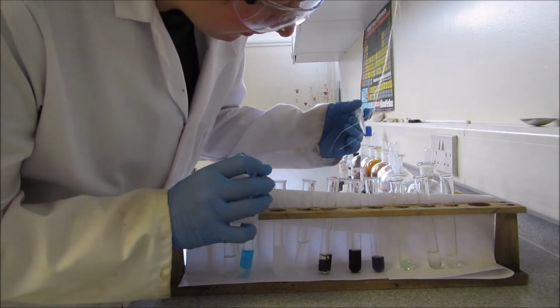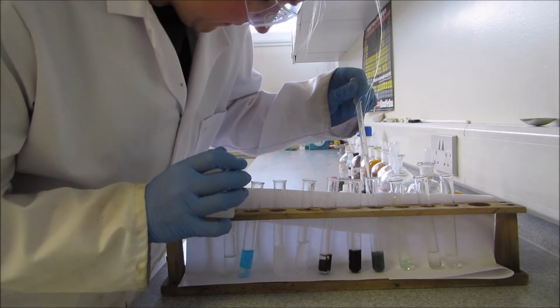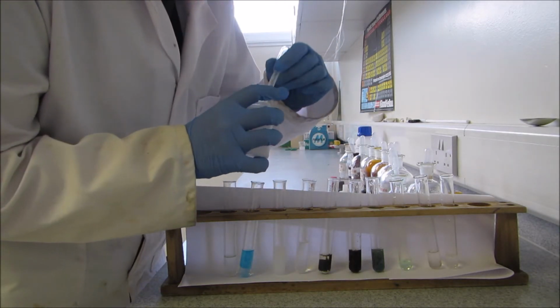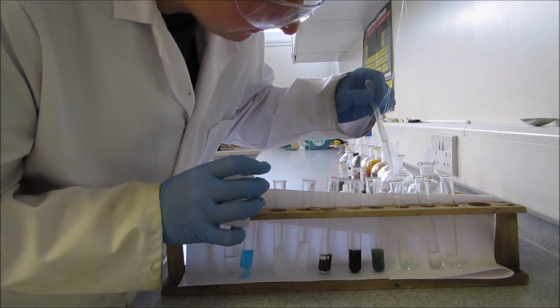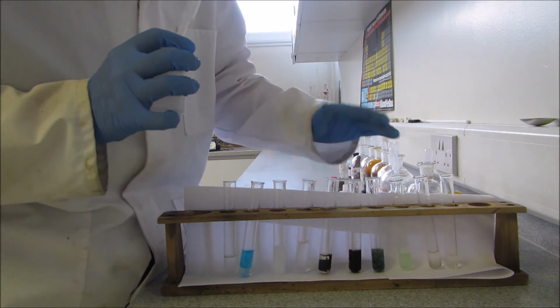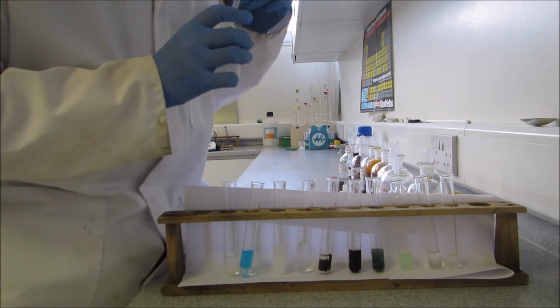Next one is chromium, and when I add sodium hydroxide, you get a sort of grey-green precipitate. One after this is nickel. When I add sodium hydroxide, you get a sort of light green precipitate. Again, that confirms that it's definitely a nickel cation.